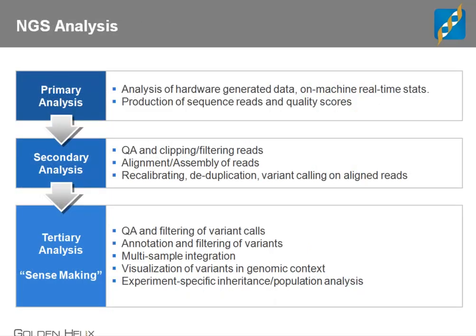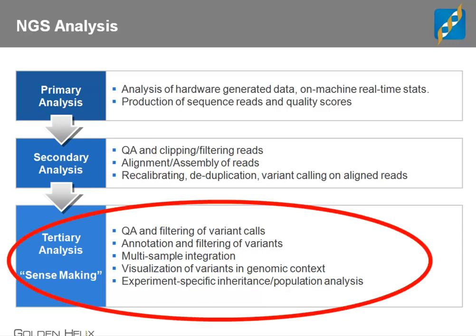So, you may have seen this slide or a similar slide many times in the past. There are different areas of sequencing analysis, and what we'll be discussing today falls directly in this realm of tertiary analysis, or the sense-making part of sequence analysis projects.